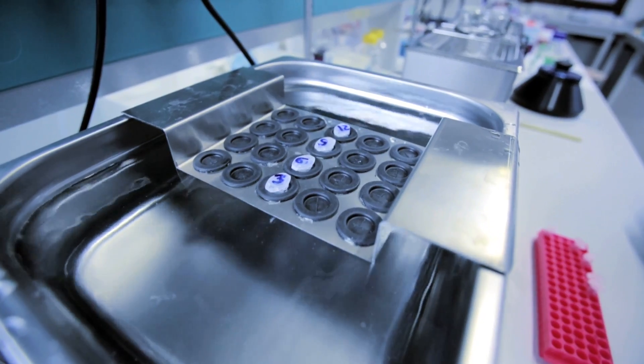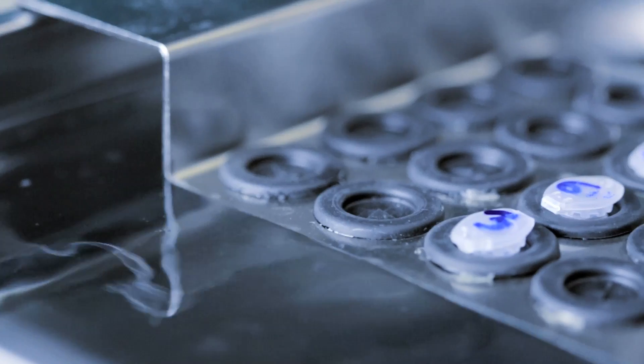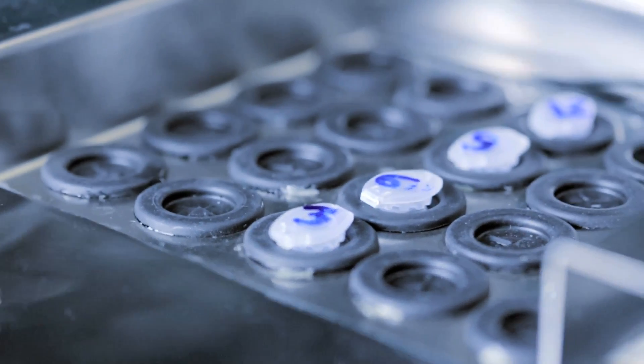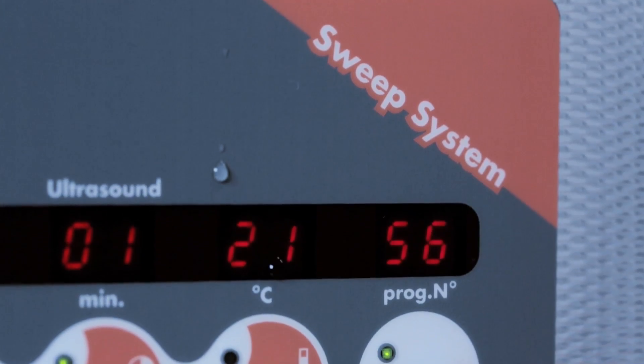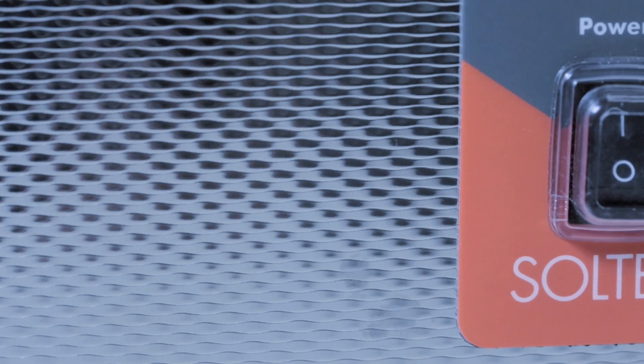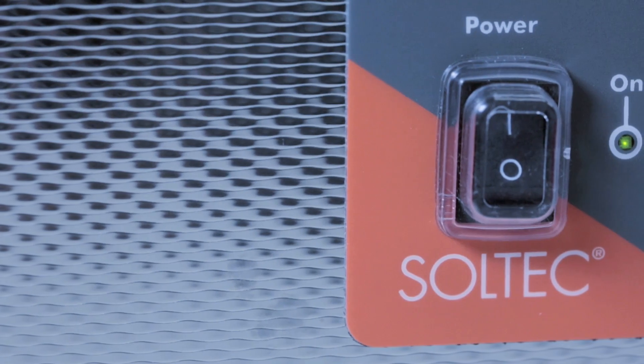Furthermore, the Sonica ultrasonic bath is equipped with a sweep system that provides better distribution of cavitation energy in the liquid that provides breaking of the cells.